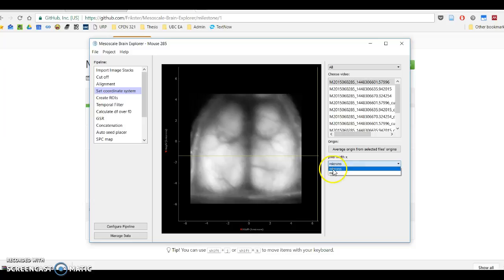Also note, we'll probably have a nanometer scale here as well, since 1 micron is the size of a bacterium. So for those doing cellular data, you might want something even smaller. But yes, just so you know, this doesn't currently really do anything, but it will in the future.